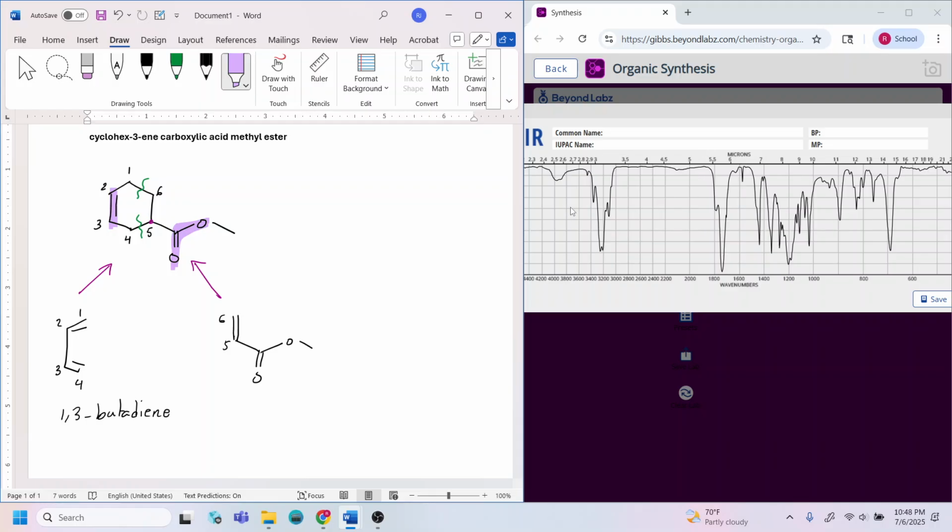So I'm going to start with the rest are simply alkanes. We're going to ignore this one over here because it is the sp3 CH stretches that I have on 4 and on 6 and on also 1. These are sp3 CH stretches and on 5 as well. So I'm just going to ignore those and start here with the carbonyl. This is the C=O.